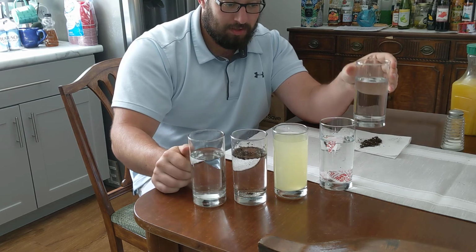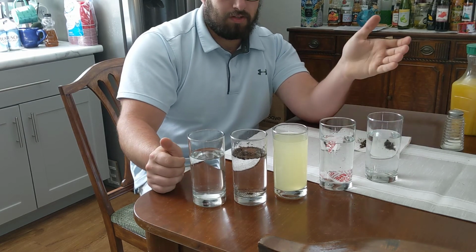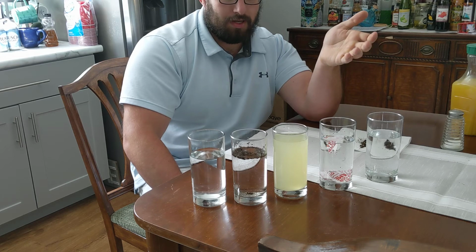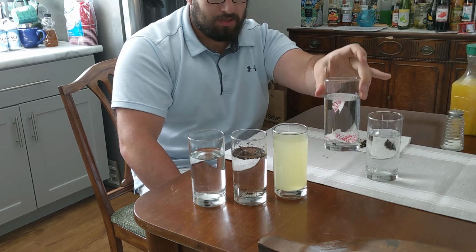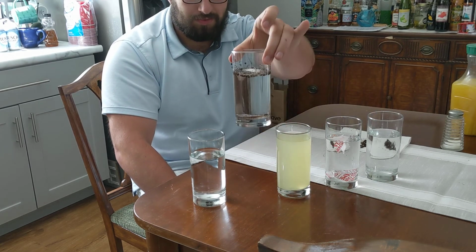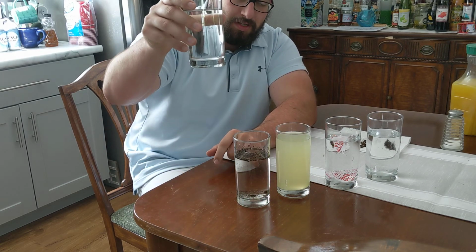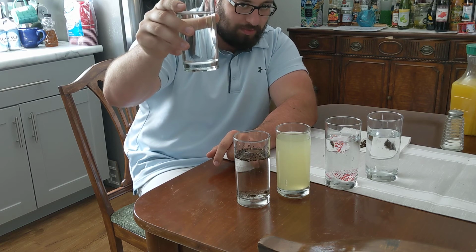So, this was just a quick little run through on all the different kinds of things that you can find in nature, or man-made versions of water pollution. Again, we have normal water, garbage, chemicals, runoff, and erosion, and the tricky one, which is your clear chemicals or clear minerals or what have you.